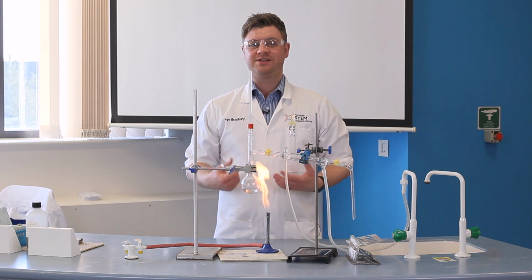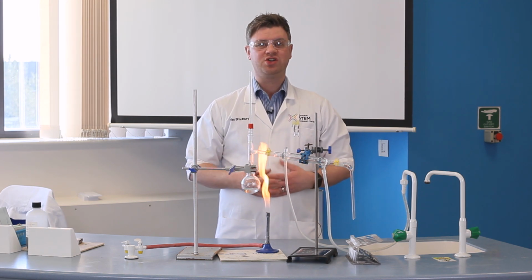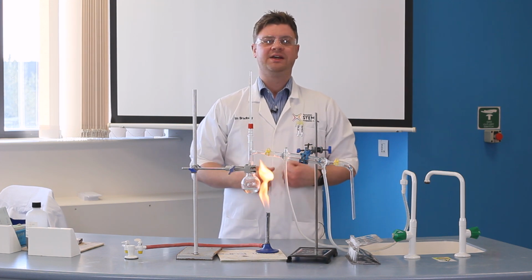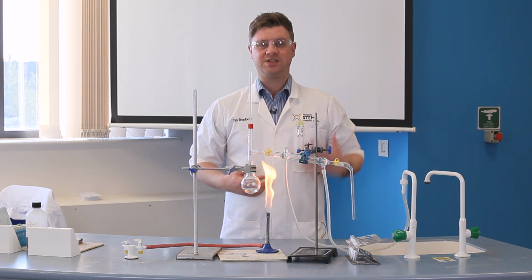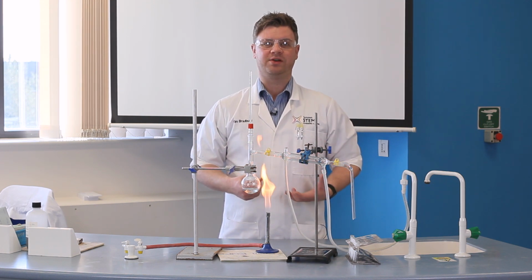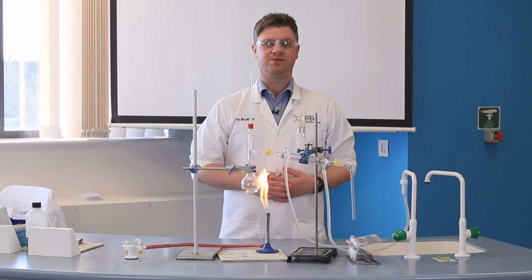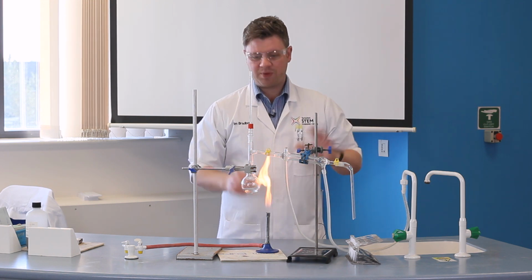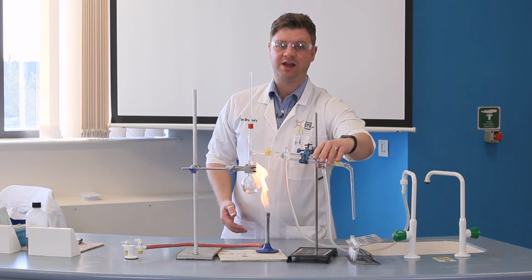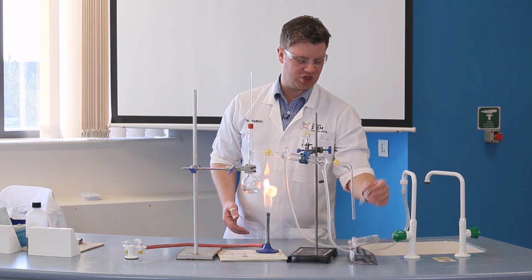So here we have the standard setup for the fractional distillation demonstration, and what we're going to do is run through this in two slightly different ways. The first way is using the teacher to conduct the demonstration, and the second is to use another adult, and we'll discuss reasons why shortly. So what we've got is the standard round bottom flask, thermometer, condenser, and then some fraction tubes.